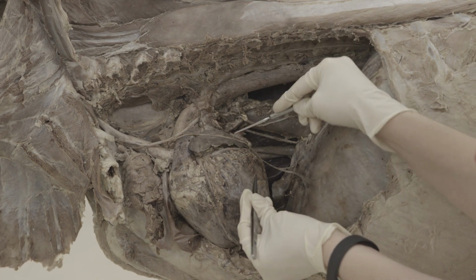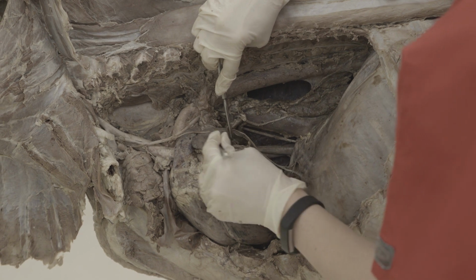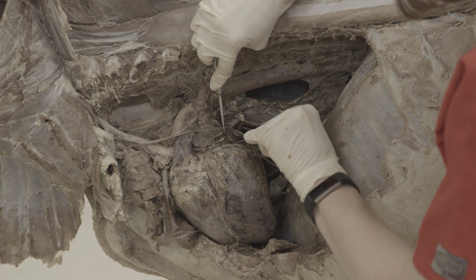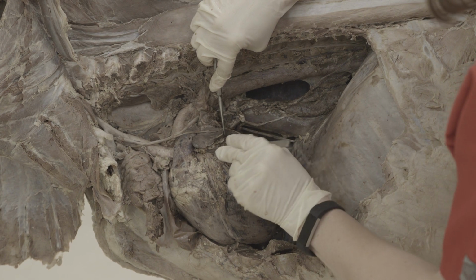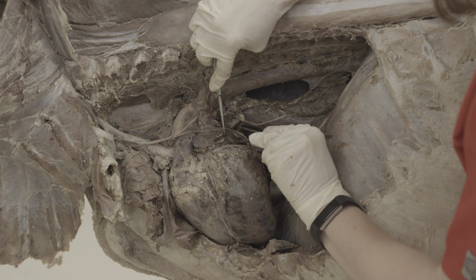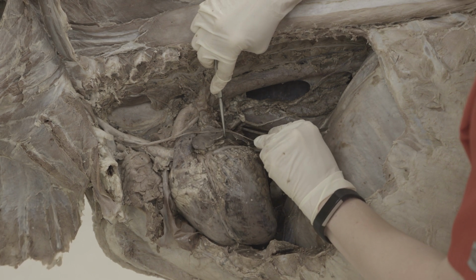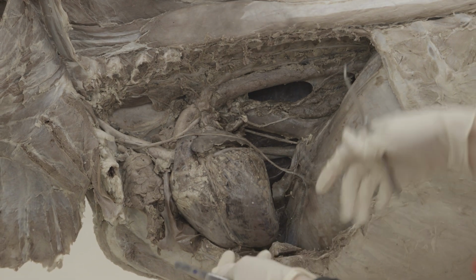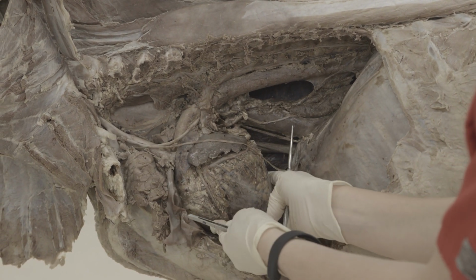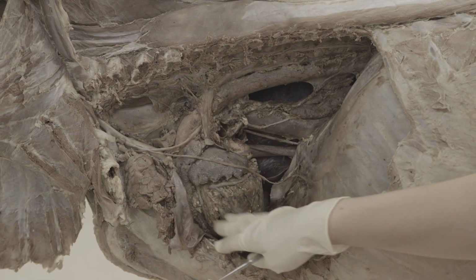it also runs alongside the great cardiac vein, which is, again, there's no injection, so it's very difficult to see, but it's running right underneath your auricle. And so the great cardiac vein is running here. It's not full, so you can't see it very well, but just so you know where to look for it. So the great cardiac vein would be there. And then when we get to the right side, I'll point out a difference in the heart that's different for the calf. But for right now, we'll just continue here on the left side.